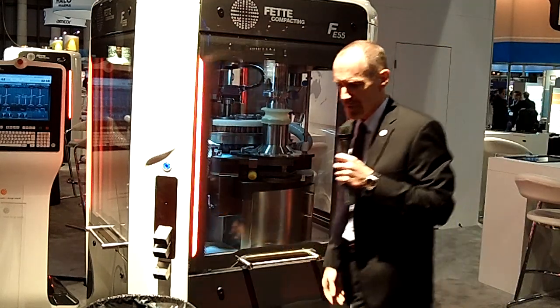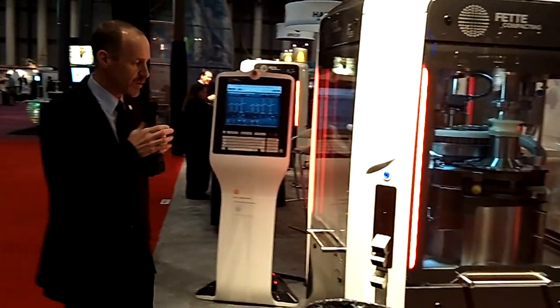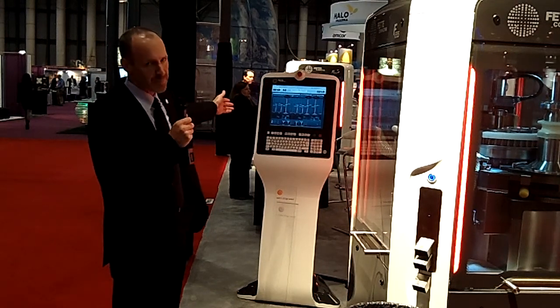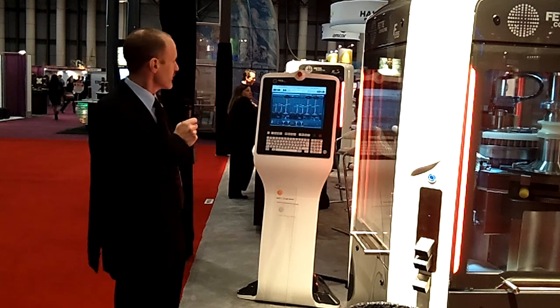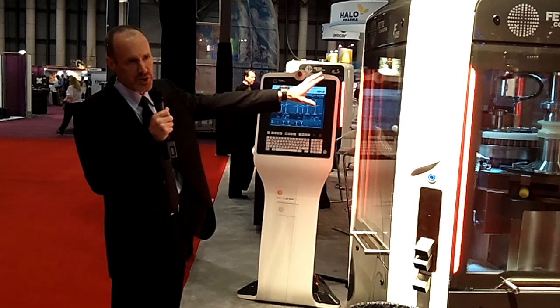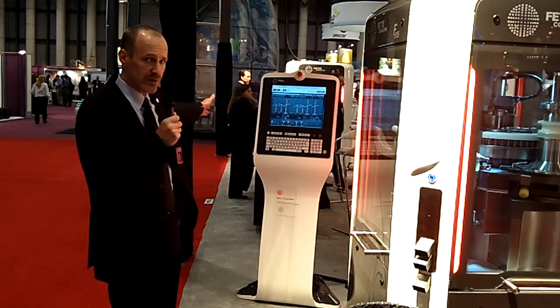The final innovation we'll mention is the new HMI, or Human-Machine Interface, panel, which you can see here. Extremely ergonomic design, smooth surfaces, and a 19-inch touchscreen display. Anything that is installed on the machine in the way of the compression stations is reflected accurately on the terminal as well.